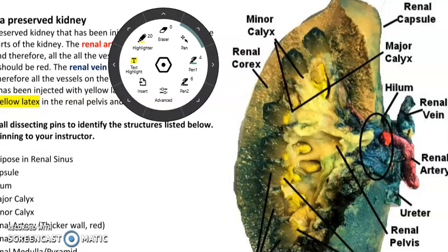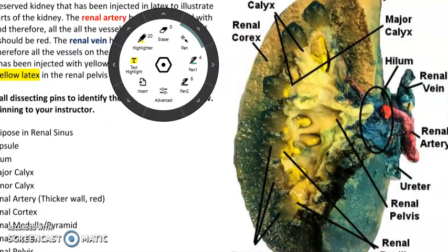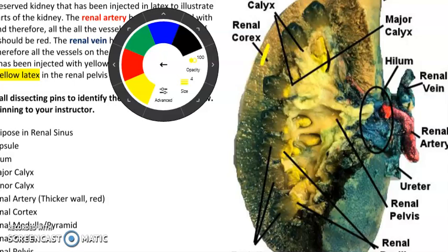This video is to show you how to draw the histology for the urinary system lab. But let's look at what we're actually looking at. This is a kidney. It has two regions. It has a cortex out here, and you see these darker regions here? Those are medullary pyramids. So we're going to draw a structure in the cortex that's part of the nephron.